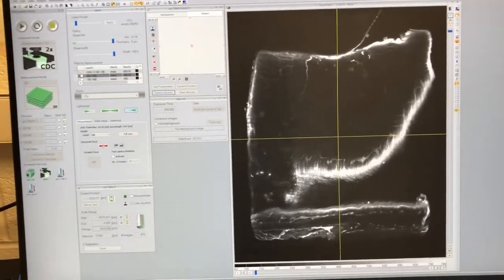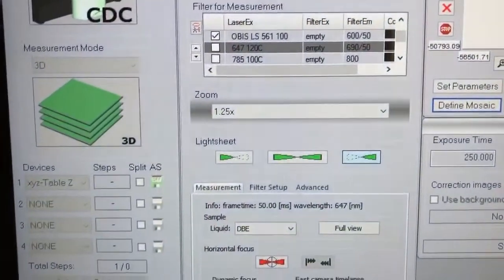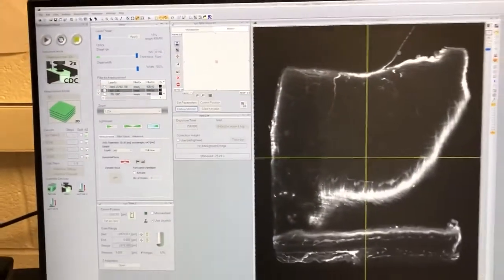Okay, so the next step once you have your zoom defined is to make sure that whatever is on the microscope itself - so 1.25 - is the same as what's on the zoom window here, which is 1.25.